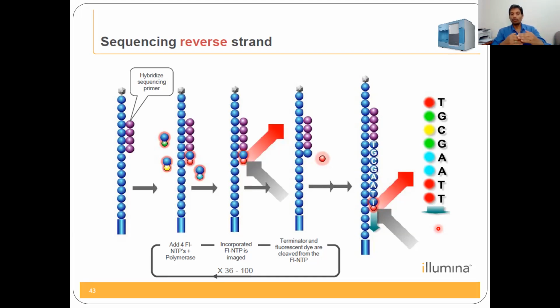So what is the advantage? When you have 300 forward and 300 reverse reads for a whole sequence of, let's say, 500, you will have 100 overlapping nucleotides, and you will get a stretch of 500 nucleotide sequence. That is one advantage.